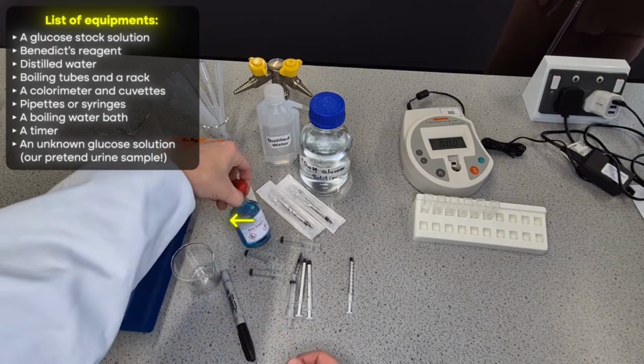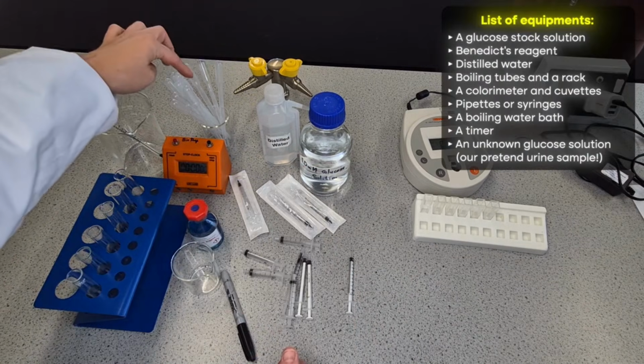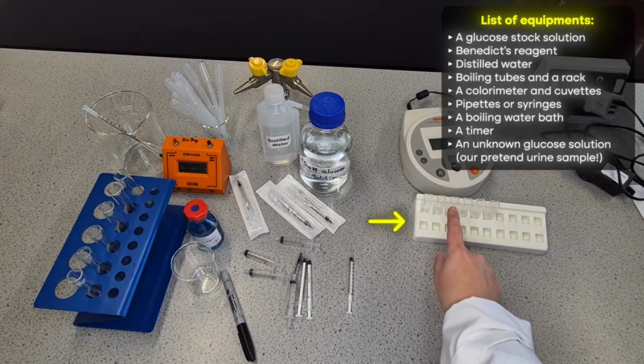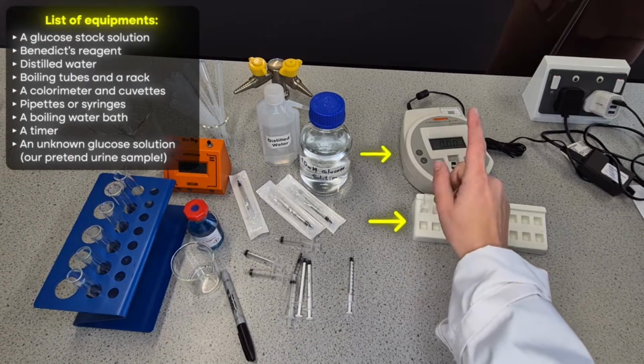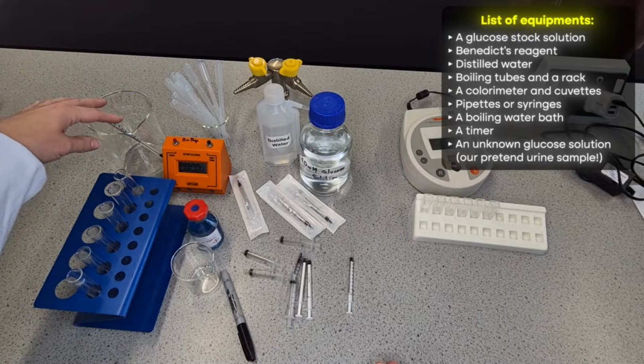I've got my quantitative Benedict's solution, stop clock, lots of dropping pipettes so I can transfer my solutions at the end into the cuvettes. I've got my cuvette holder, my colorimeter, and I've got a large beaker and a thermometer to create my water bath for the experiment.